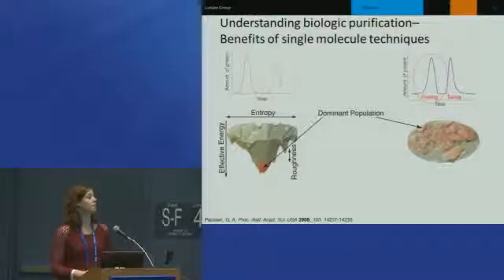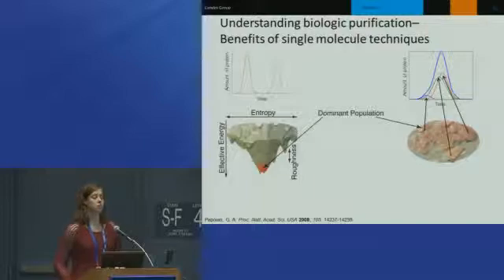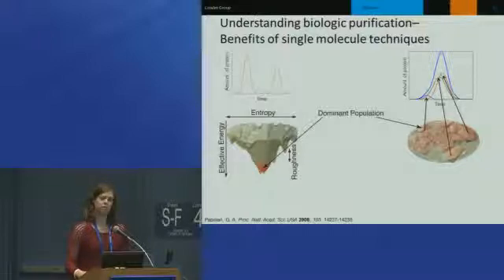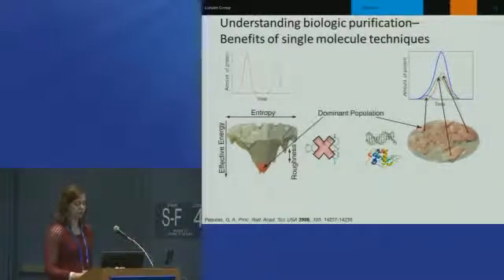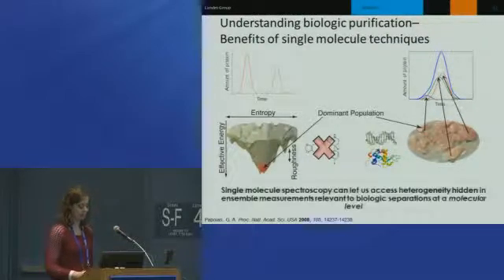And if we're thinking mechanistically, we might imagine that underneath the fronting and tailing that happens in these peaks, there's actually multiple processes going on, including these very rare strong events that Mary talked about at the surface of the silica. And if it were possible to understand at the mechanistic level each one of those types of interactions, you could tune in the mechanism that you would desire and tune out all the others by doing things like polymerizing at the surface of the silica. And of course, you'd like to do that in terms of the more complicated and heterogeneous protein structure. So that's our goal: to understand the underlying heterogeneity that leads to the broadening in elution peaks.